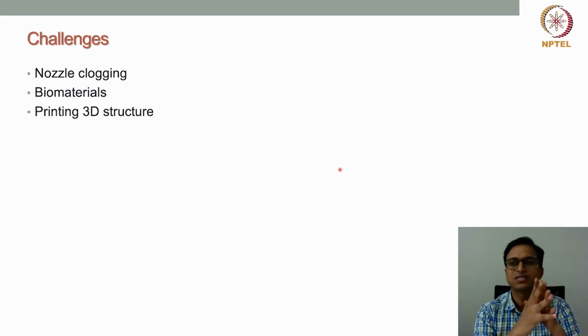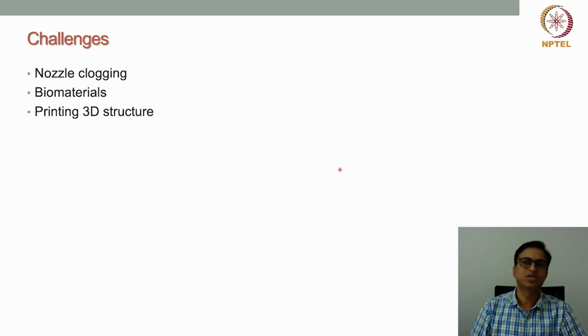Another thing is that not every biomaterial can be used with inkjet bioprinting. Suppose we cannot use highly viscous material here, so that can be a challenge. But of course a wide range of biomaterials are possible.